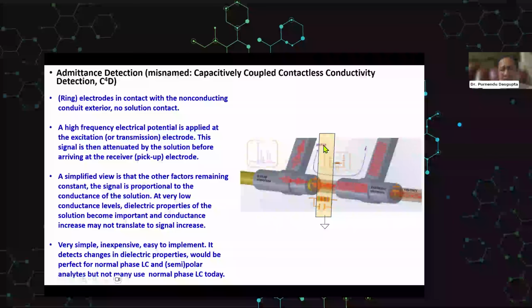So you've got to have a metal foil that is grounded to keep them from talking to each other. Easy for one to say, but these are overall very easy to construct. They are very cheap. There are a number of sites, open design, open C4D sites, and you will find them easily.